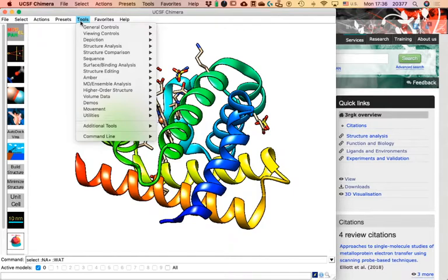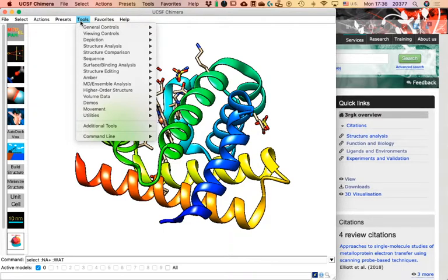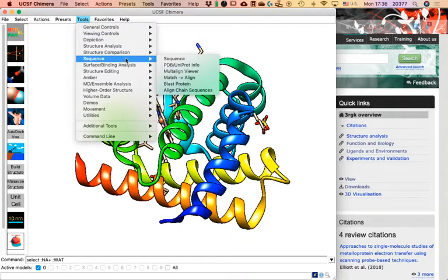The Tools menu is the most complex and rich part of this program. You have all of these options — some fairly obvious like Viewing Controls, Structure Analysis, or Sequence — and others more difficult to understand, such as Higher Order Structure, MD/Ensemble Analysis, AMBER, or Structure Editing. Each is grouped for different activities. For example, last class we used Sequence with the UniProt info to analyze the relationship between sequence, structure, and function.